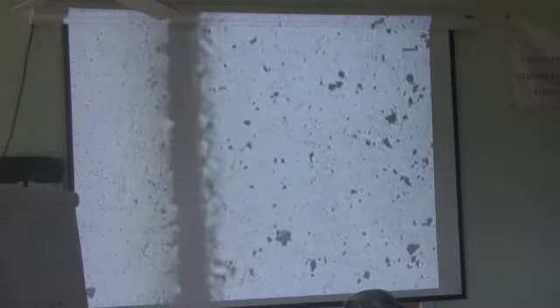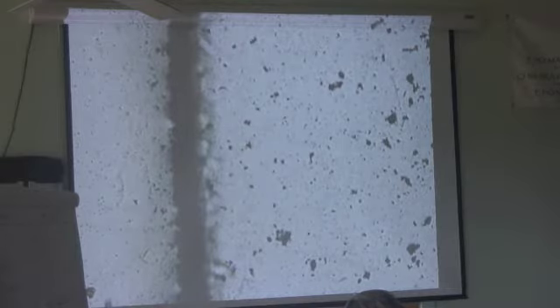Fair to compare things that you're only looking at, put that into the equation. So I did my cover slip back and forth and then just dropped it onto the slide. And now we don't have to fuss anymore about the plastic going underneath your holder.